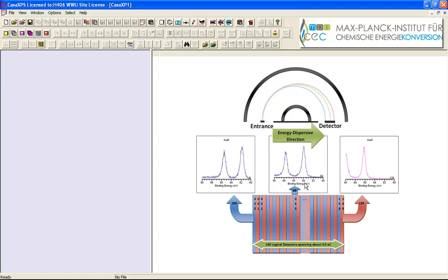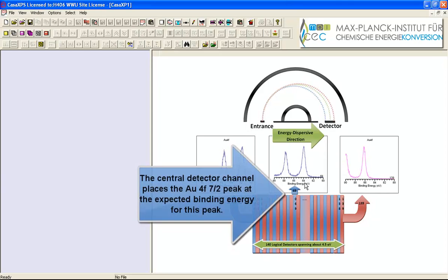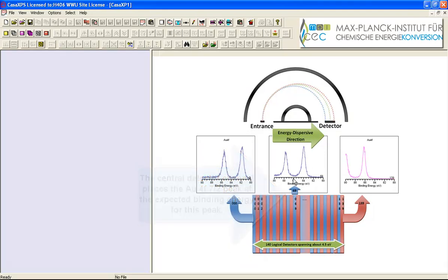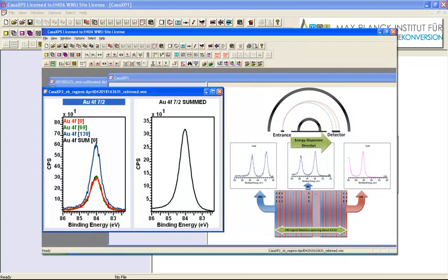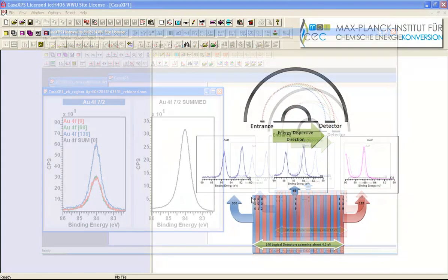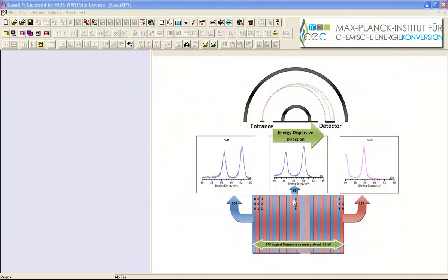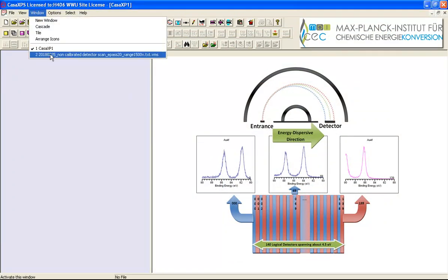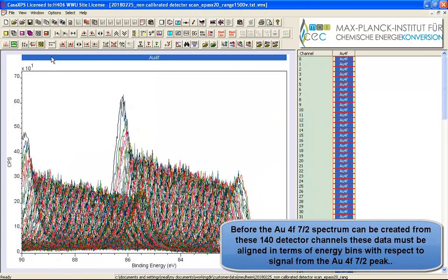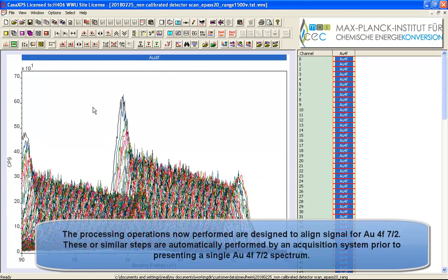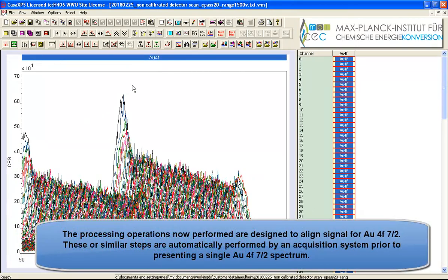Hence we get a gold 4f peak 7 halves that is at about 84 eV. So the spectrum that would be presented for this gold 4f by a data system would be the one that has summed all the information from all of these detectors. So let us now go through and perform the types of operations on these data that you'd have to do to produce a single spectrum from these 140 individual spectra.